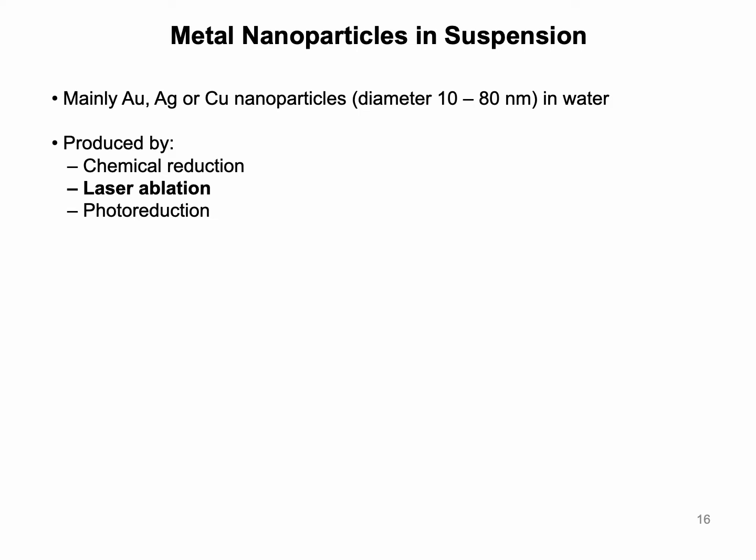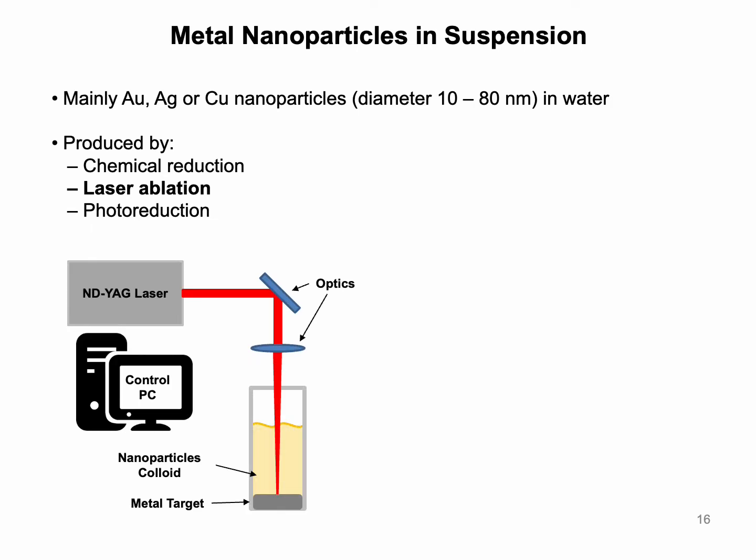It is true that there are numerous retailers that sell noble metal colloidal dispersions with different geometries, size, and purity, but these might not be readily available or economically feasible for everyone. In light of this issue, we adopted a method to prepare the silver nanoparticles in-house for NLIBS using a relatively simple and cost-effective method. Essentially, we use the same system adopted for LIBS measurements, as sketched here in the slide.